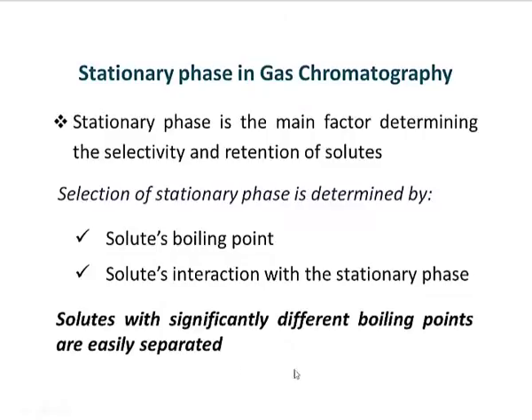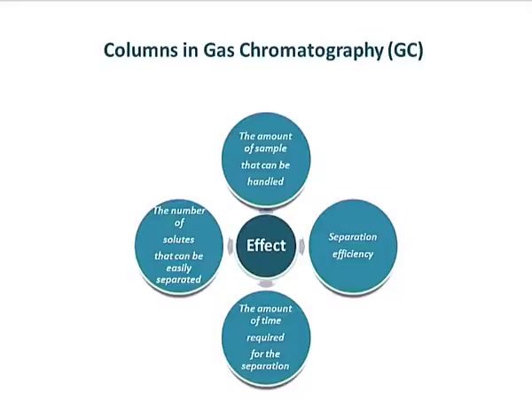So, solutes with different boiling points, as I said, can be easily separated. If they have very significantly different boiling points, separation in gas chromatography is easy. But what if the solutes you are taking are not so easily resolved and do not have much difference in boiling points? We will see what the implications would be then.